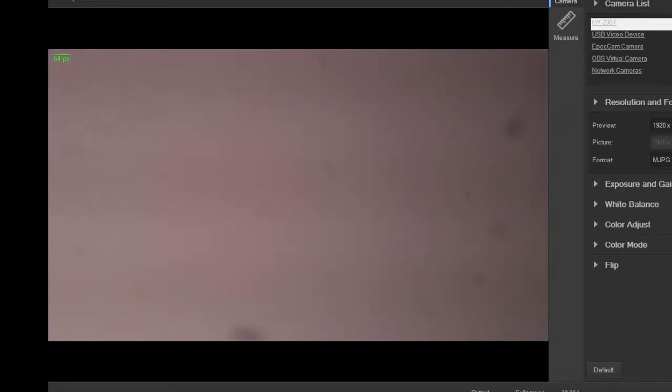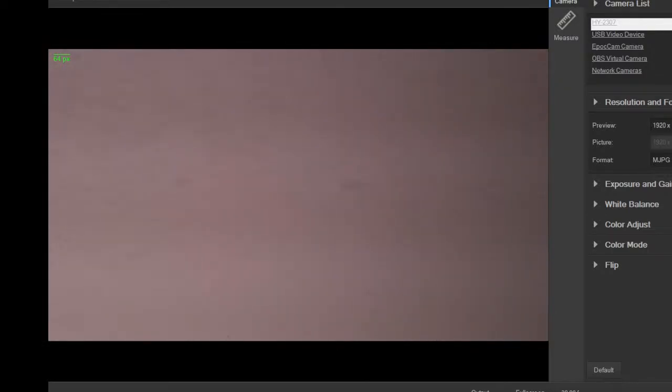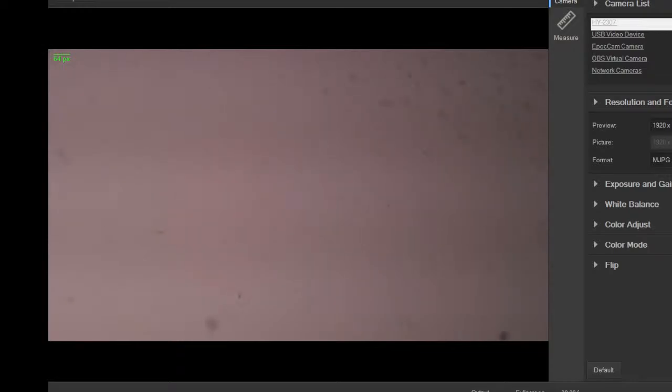So far nothing. Pretty damn sparse, actually. Again, some decaying material. Edge of the slide, the cover slip. Looks like a little plant material there.